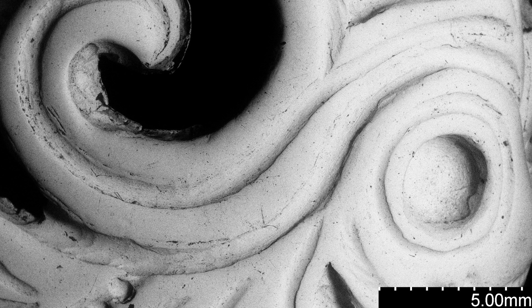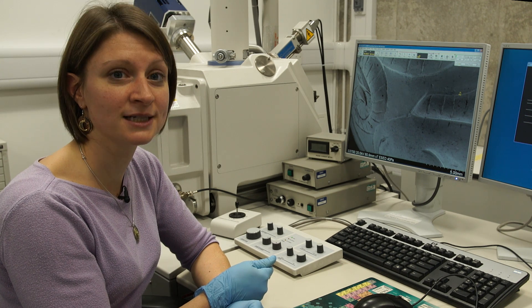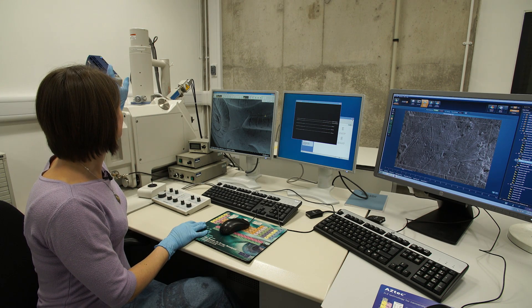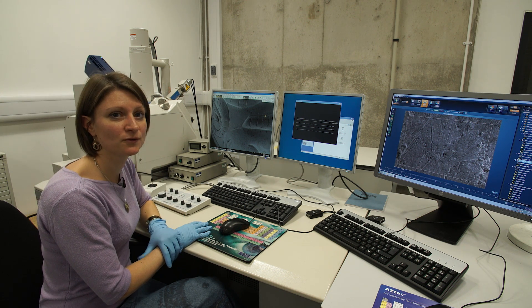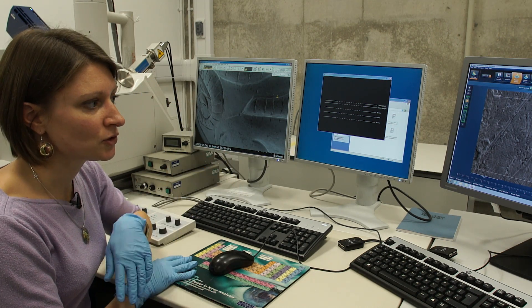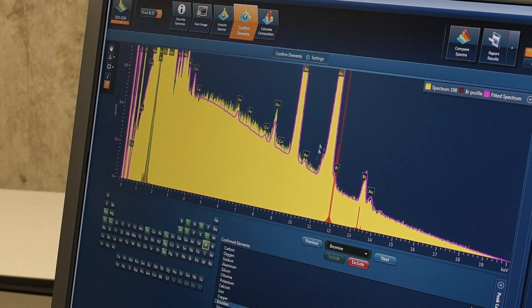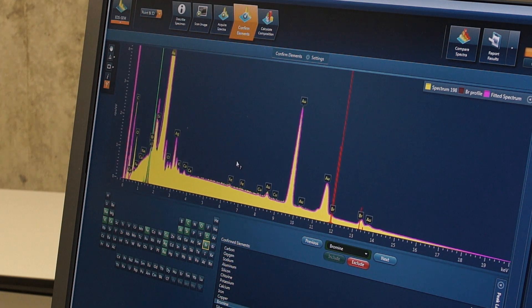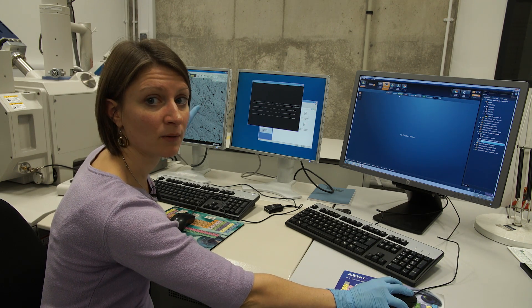So the scanning electron microscope, as I've shown, allows us to capture high resolution images, but it also allows us to analyze compositions. The SEM is equipped with a detector for energy dispersive X-ray spectroscopy, which allows for chemical characterization of a sample or an object. This detector allows us to acquire spectra typical of the chemical composition. In our case we're looking at gold alloys, so we first acquire an image of the area we are interested in.